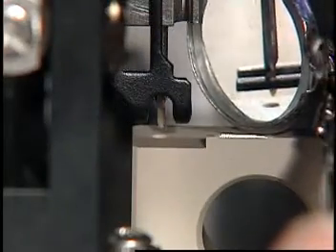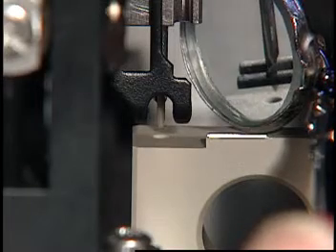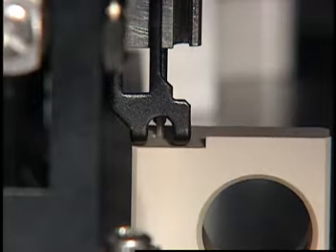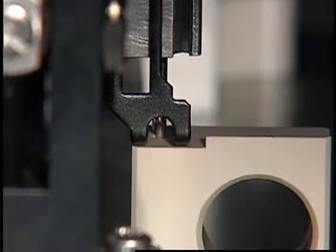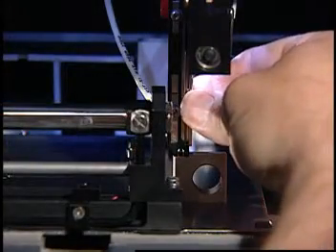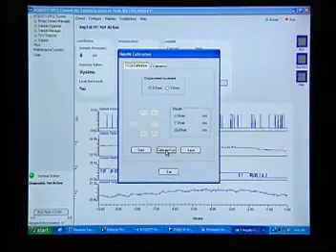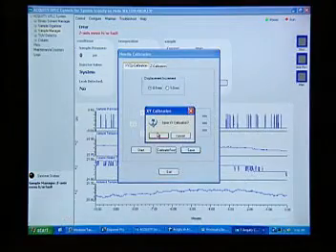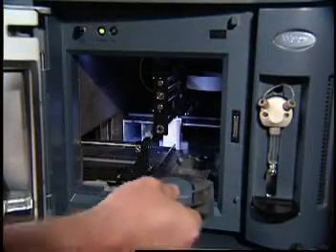With the aid of a dental mirror, further adjust the front-to-back location of the puncture needle using the Y+ and Y- buttons. Using the 0.1 mm displacement increment, lower the needle into the teach block hole to confirm an accurate X and Y alignment. Ensure that no lateral deflection of the puncture needle occurs by grasping the needle and moving it back and forth. Click Calibrate Foot. Then click Save. A confirmation window appears. Click OK. Finally, remove the teach block and reinsert the sample tray holder.